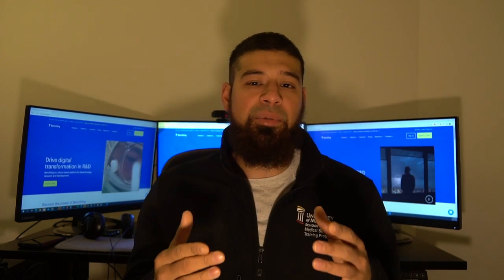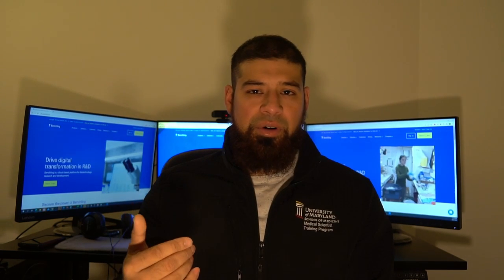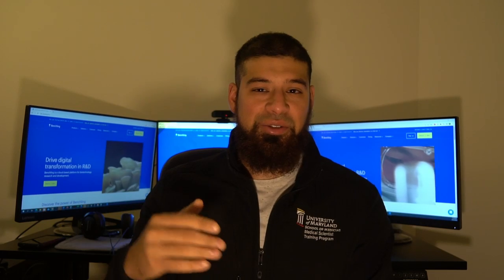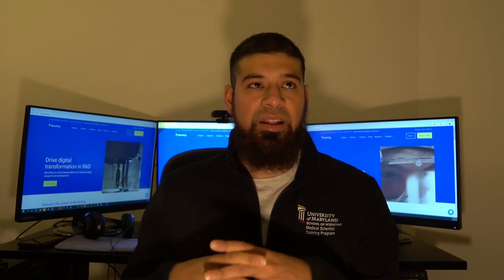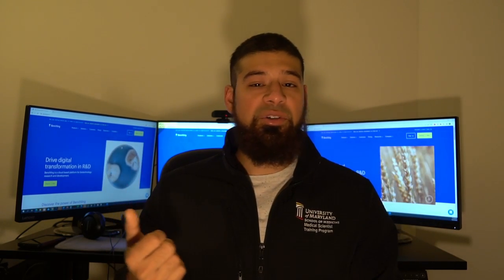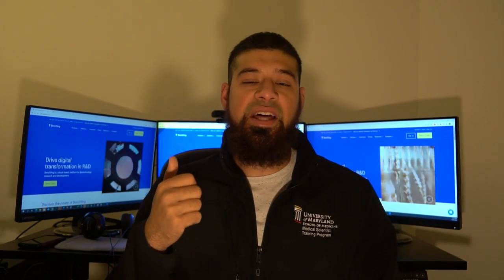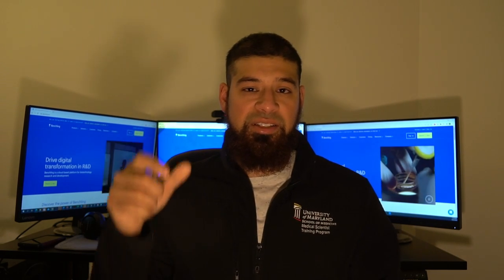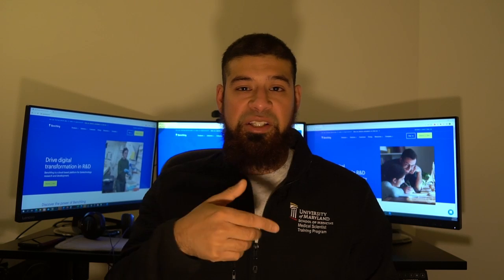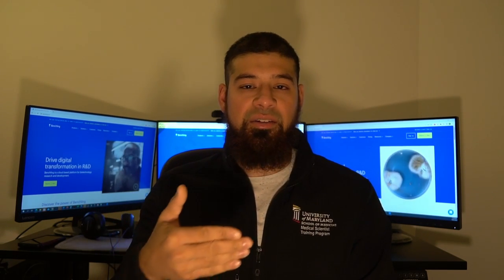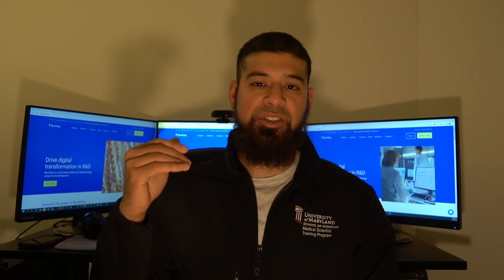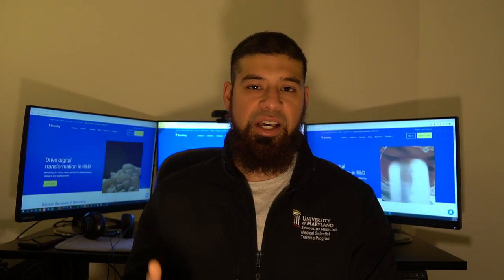I started looking for electronic lab books specifically, tried a few, and the one that really caught my eye was Benchling. It has a number of really cool features. The main one that sticks out is the calendar view, so you can set up your experiments with the dates you plan to do them and pull it up in a calendar view, which makes it really easy to visually track and organize your experiments.